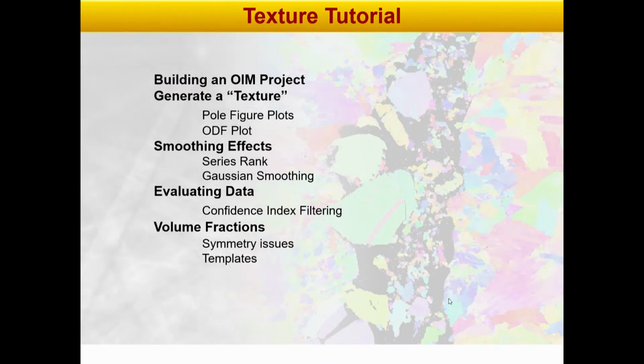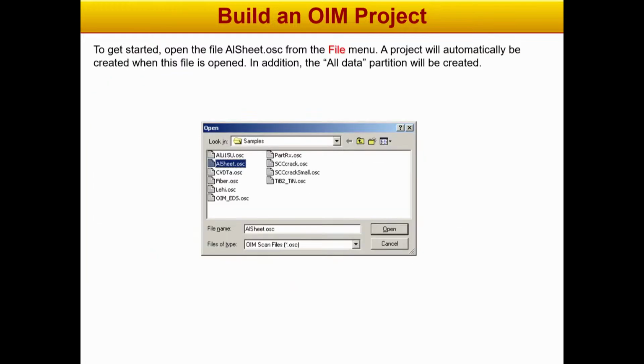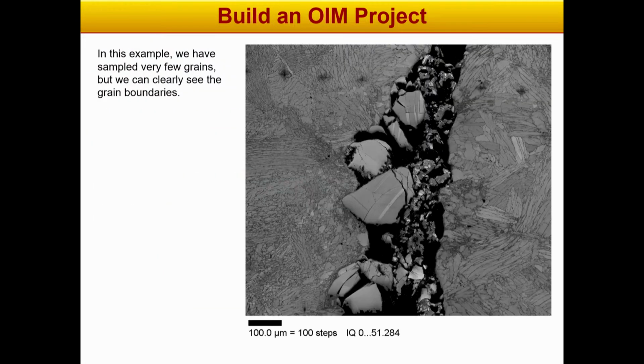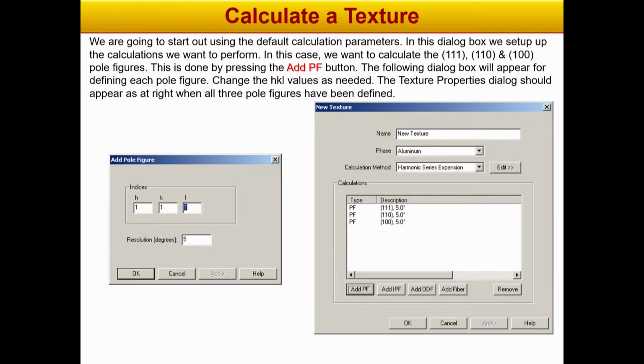Okay, so here are the notes. These came from Stuart Wright at EDAX. They go through step by step how to do things, what the project tree is, everything from opening the data set to doing individual maps. So if you've never used OIM analysis before and you want to try something, it's a good set of notes to follow.